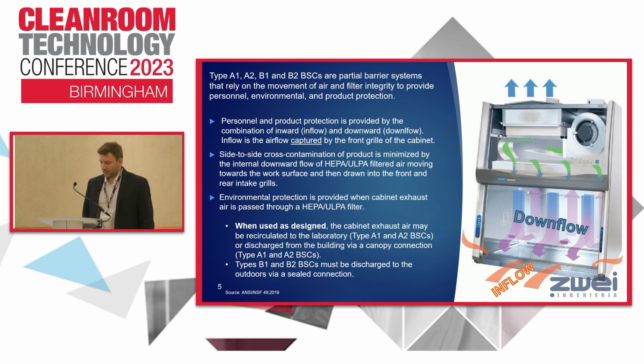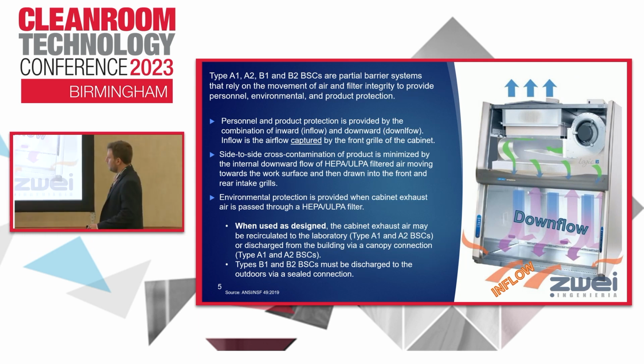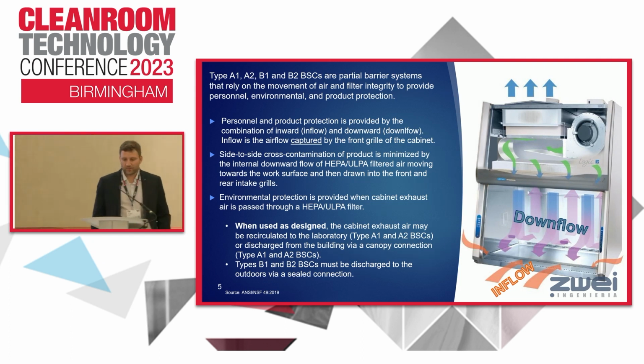The airflow that is captured by the front grill is named inflow. If it's too high, your samples will be contaminated. If it's too high, the air of the laboratory gets into the workspace and contaminates the samples. If it's too low, you can get contaminated because you lose the barrier that protects you from the pathogens inside the cabinet.